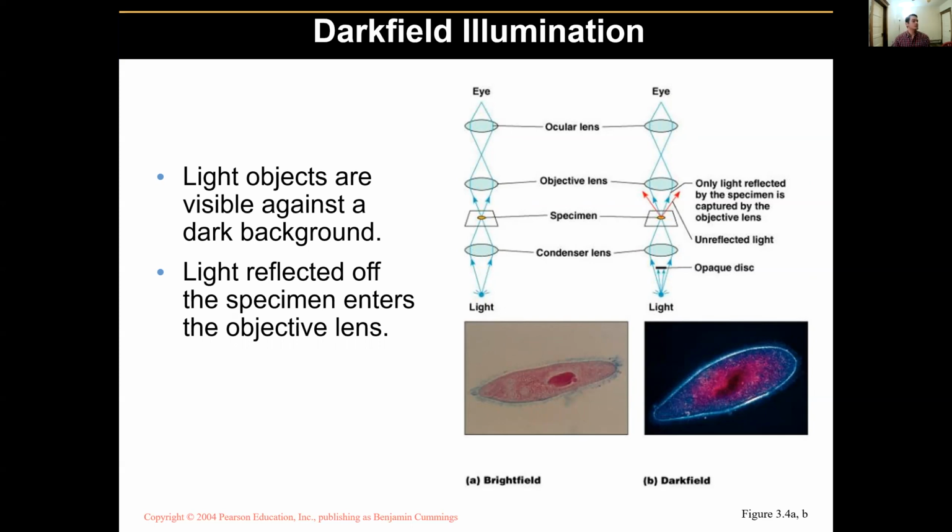This type of microscopy is frequently used to examine live specimens or structures that can be damaged if you were to stain them for the bright field process. So it's more sensitive in that sense, or it can be used to examine more sensitive structures, I should say, sensitive structures and specimens that could be disrupted or damaged by staining.